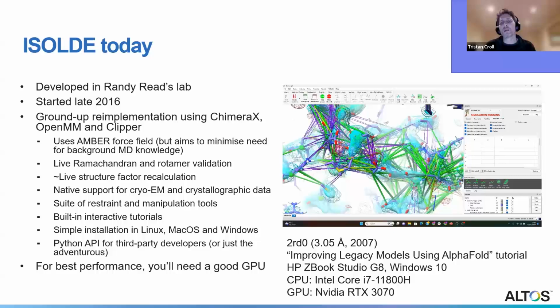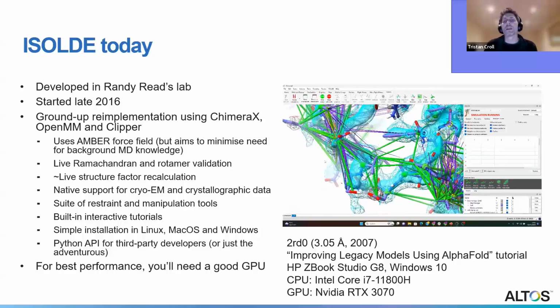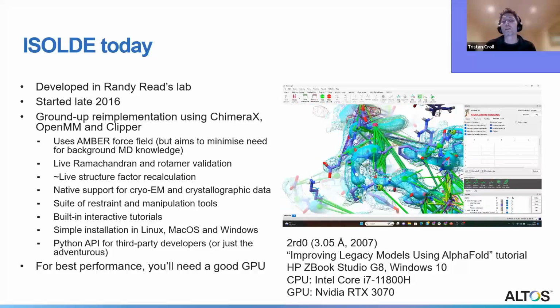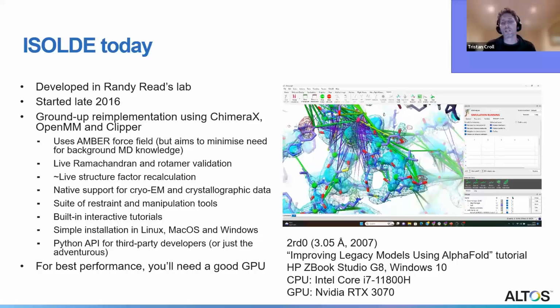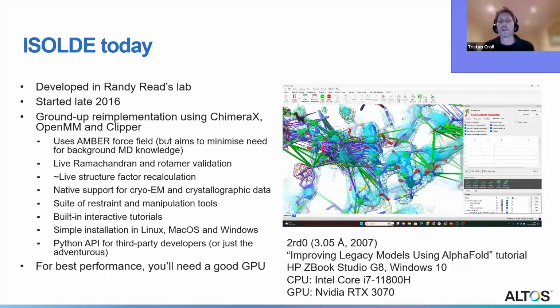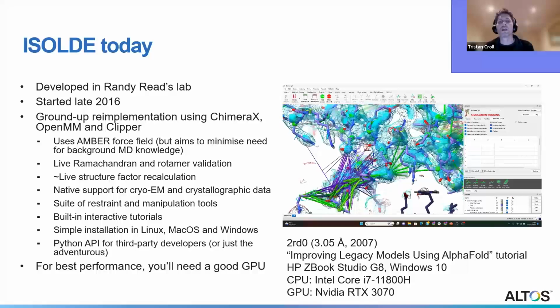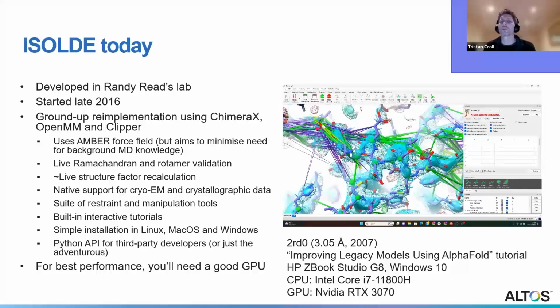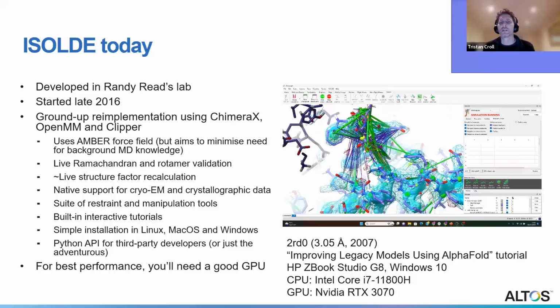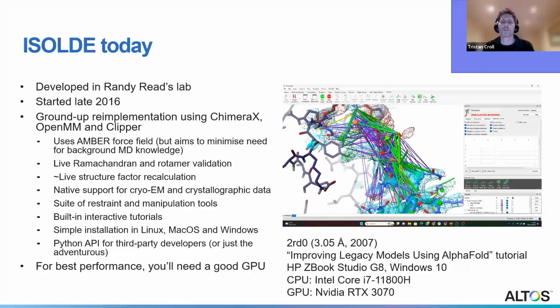And what you're watching here might be a little bit confusing, but this is one of the built-in tutorials of ISOLDE as it stands today, using a web of distance restraints based on an AlphaFold model to interactively clean up a very old legacy model, a 3 angstrom model from 2007, with many of the same sort of problems as I originally ran into in the insulin receptor, various out of register regions, the sort of thing that would have been a huge pain to rebuild pre-AlphaFold, but now in ISOLDE with these sort of restraints, it's actually a fairly straightforward tutorial that you can get through in the whole model in a few hours.